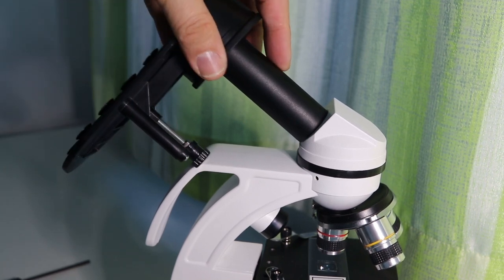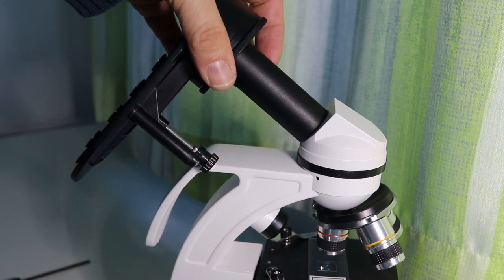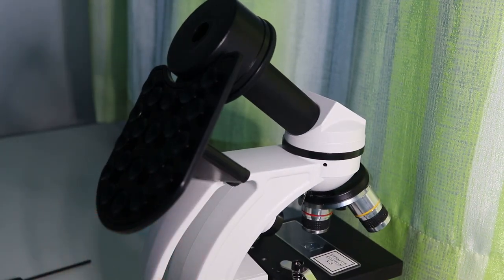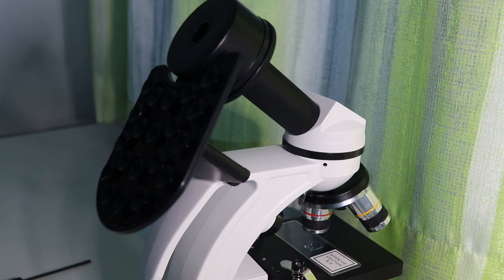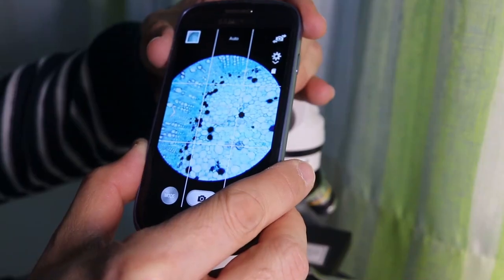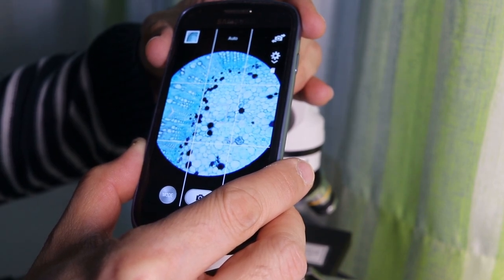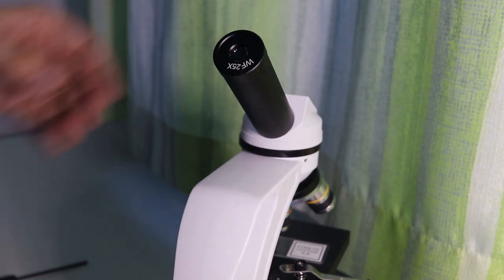Unfortunately, it doesn't work. And the bottom part here actually has to be a little bit off because it bumps into the handle of the microscope, but this is not a problem really. Okay, so what you have to do is hold it by hand. If you want to get a full field of view, you basically have to hold it by hand.